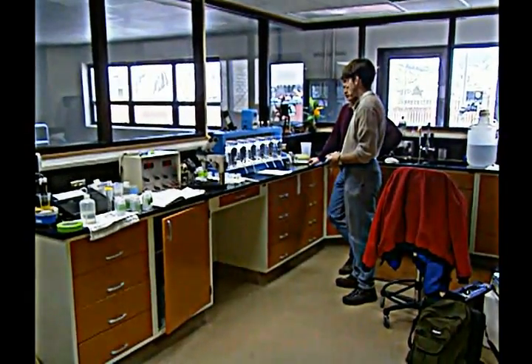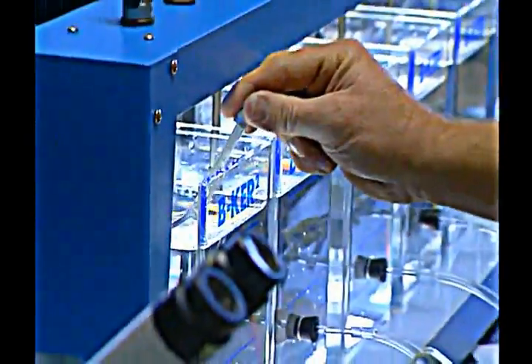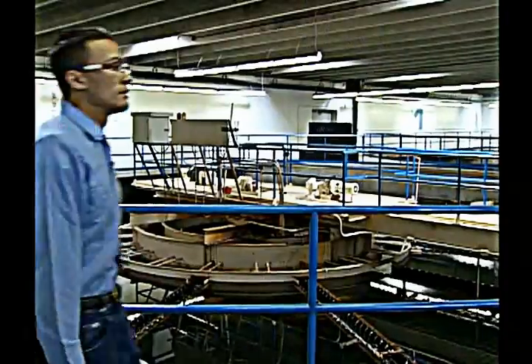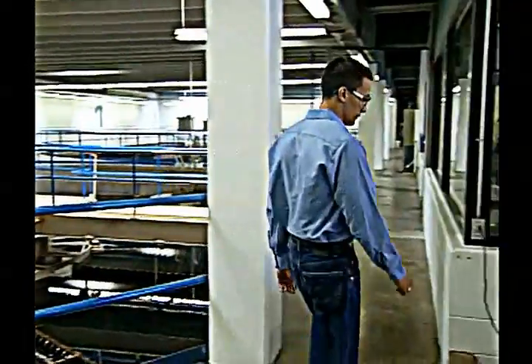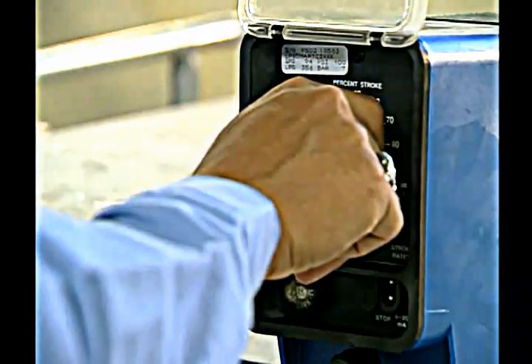Before coagulation can take place, the operator must determine what type of chemicals and at what doses will best treat the turbidity in the raw water source. This is an important step because not only do operators need to treat the water effectively, they must do so in a cost-efficient manner.